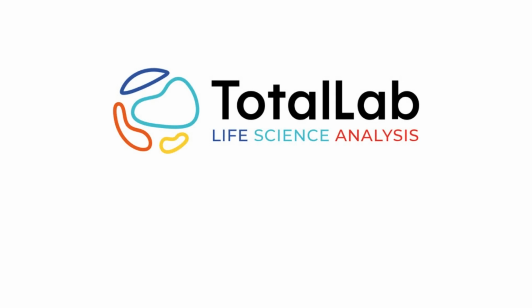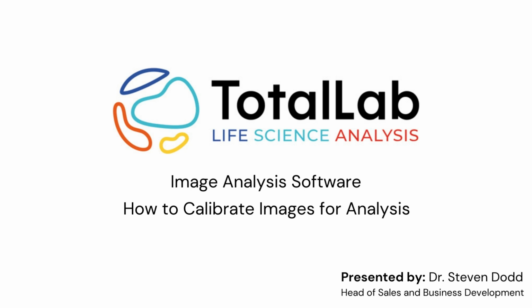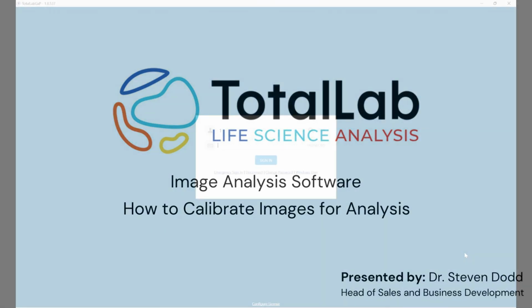Hello everyone. So today I'm going to be showing you how we can calibrate images using step wedges within our TotalLab GxP 21 CFR compliant software.